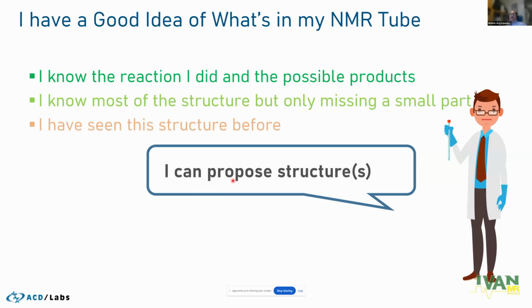So you record your spectra, you have your proposed structure, and then the task is to see whether the spectra agree with the structure or whether the structure is correct for these spectra. And you can't always categorically conclude that the structure is correct. You can conclude that the structure is wrong. And in essence, you say that the structure is correct just because you can't prove it wrong. But anyway, you see what I mean.